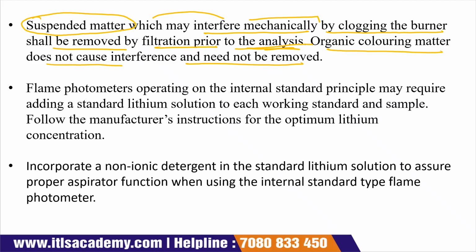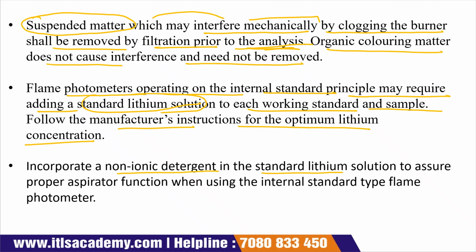If organic coloring matter is present, it does not cause any interference, so we don't need to remove it. Now, for a flame photometer operating on the internal standard principle, it may require adding a standard lithium solution to each working standard and sample. Follow the manufacturer's instructions for optimum lithium concentration. Incorporate a non-ionic detergent in the standard lithium solution so that we ensure the aspirator is functioning properly when we are using our internal standard type flame photometer.